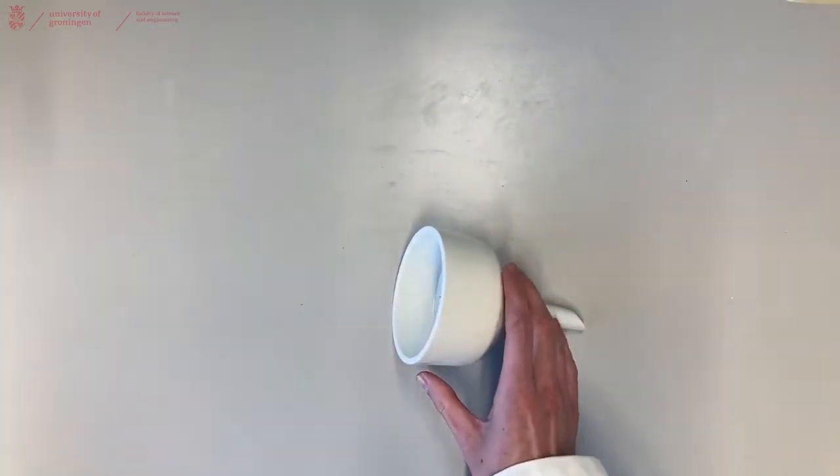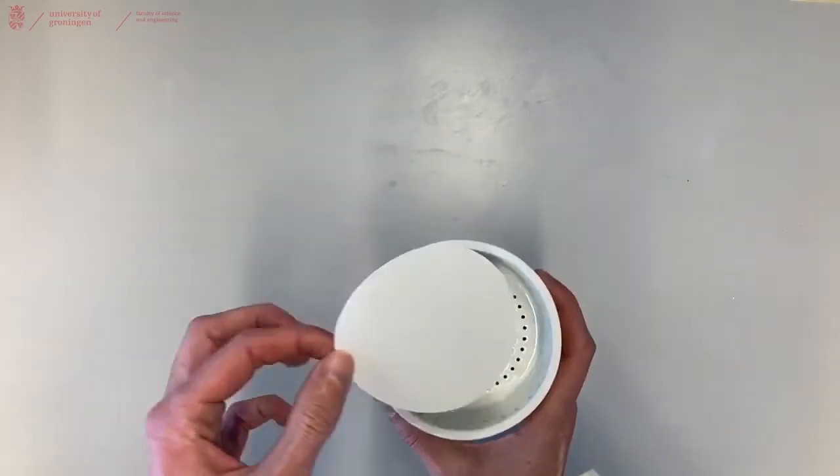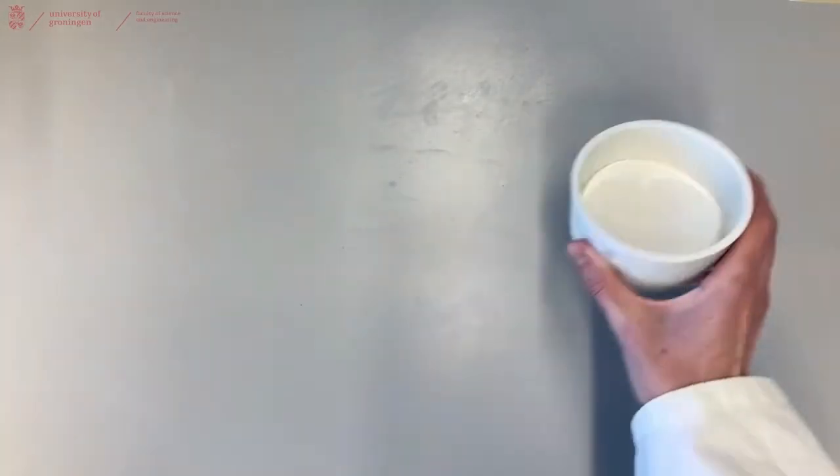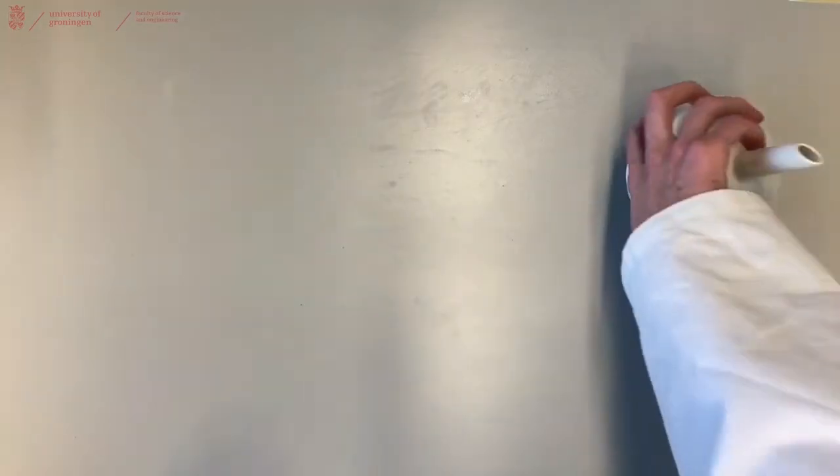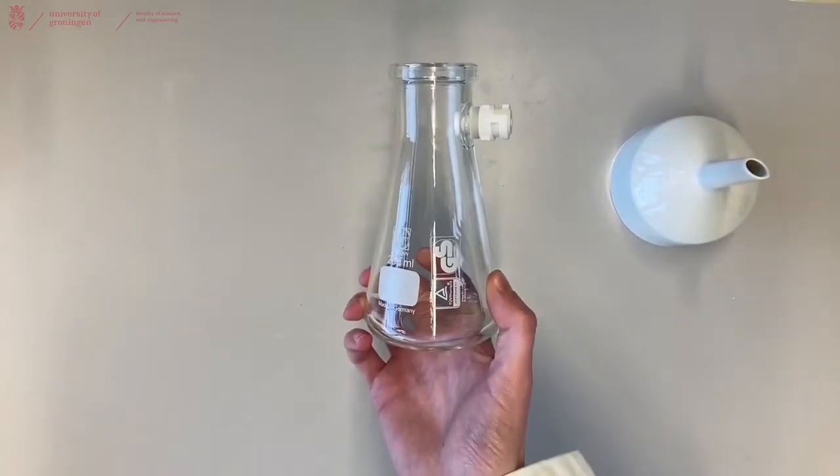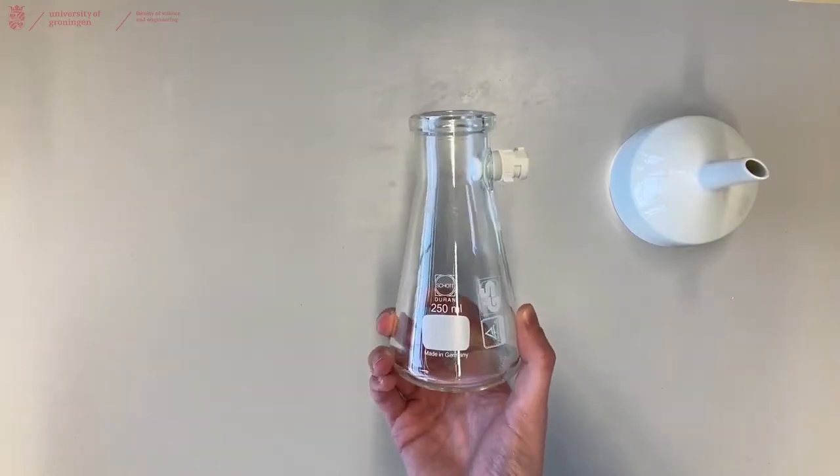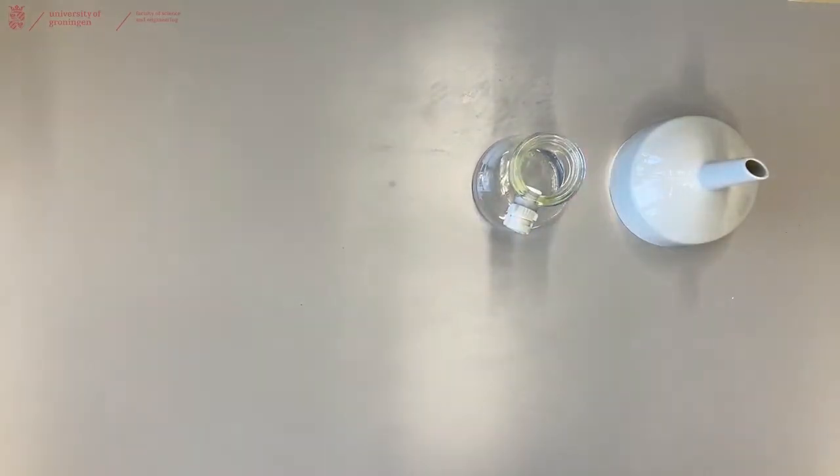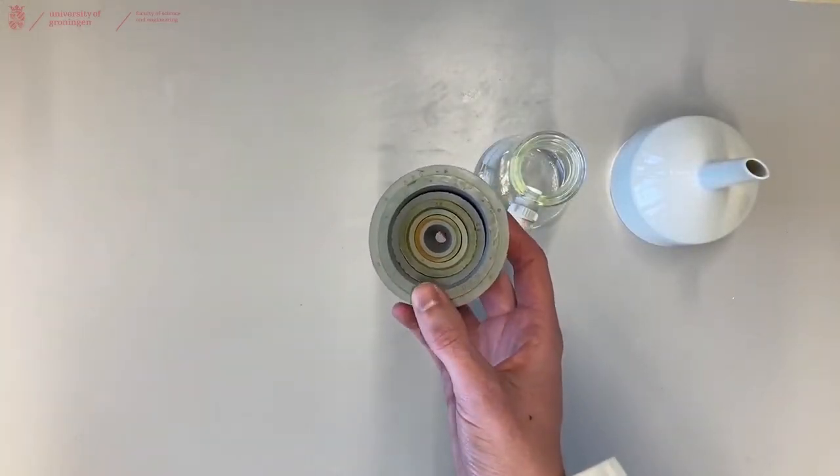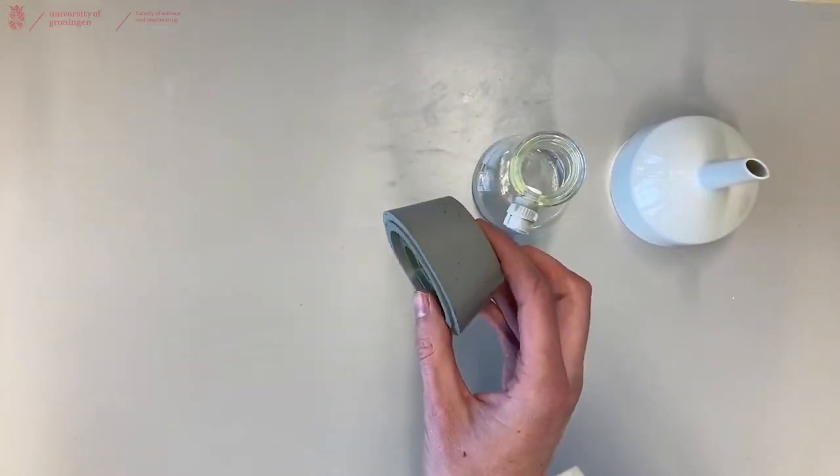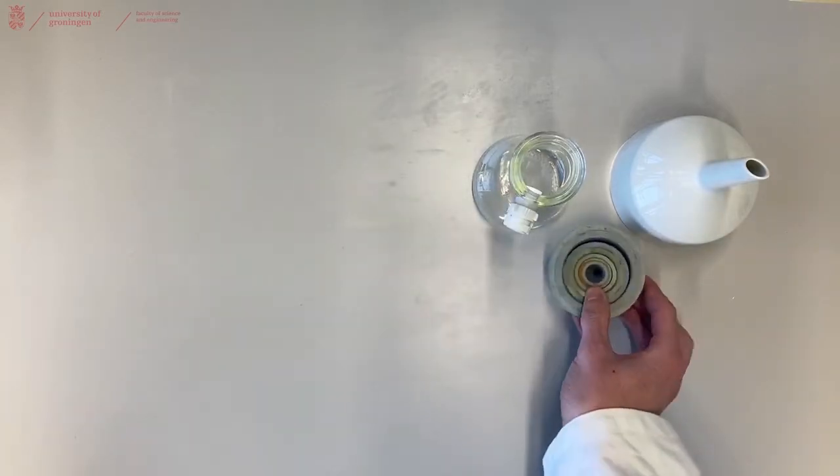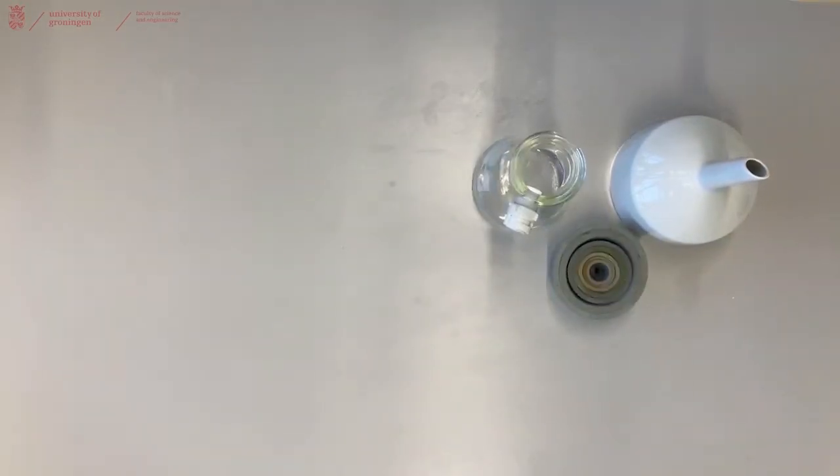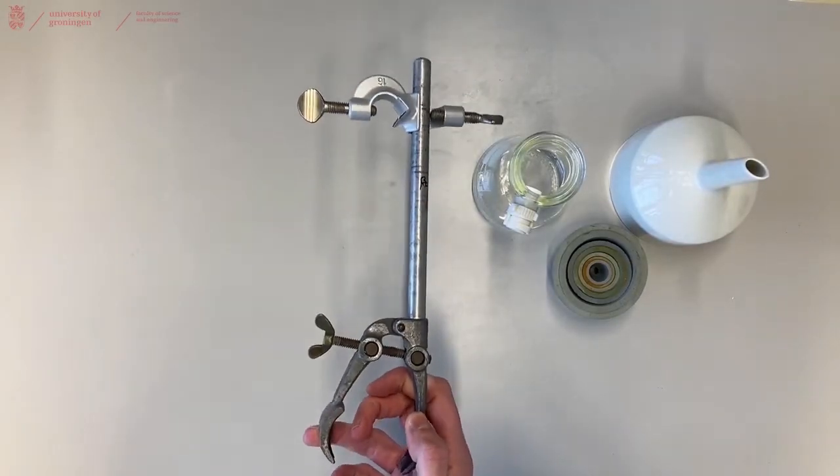For the Buchner funnel you will require a filter paper that fits inside your Buchner. You can collect the liquid in this filtration flask. To make sure that you have a proper vacuum seal between the Buchner and the filtration flask, you can use neoprene rings. During the filtration you will need to clamp your filtration flask to the fume hood using a normal clamp.